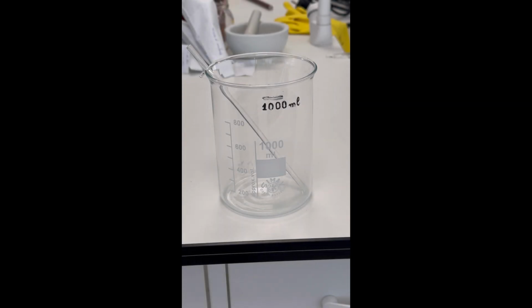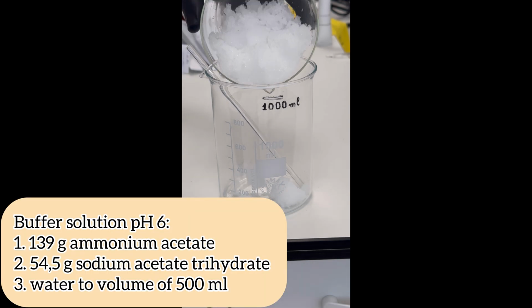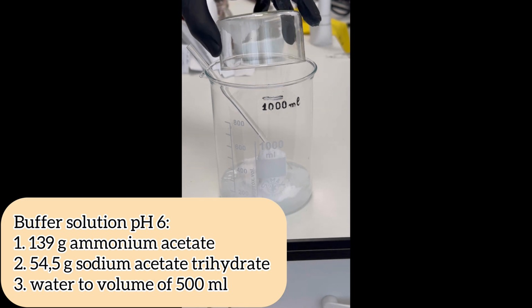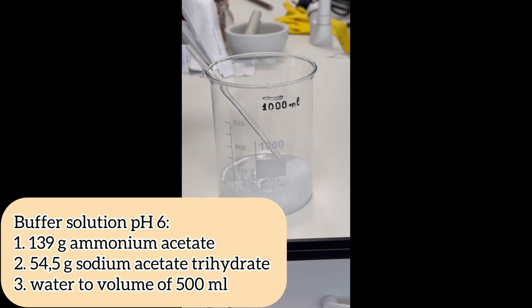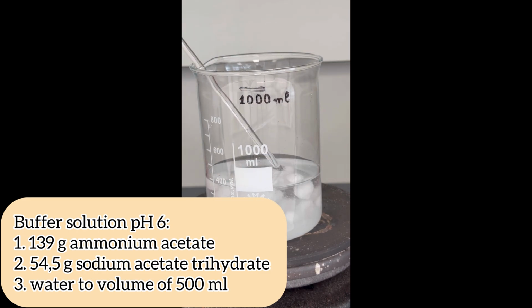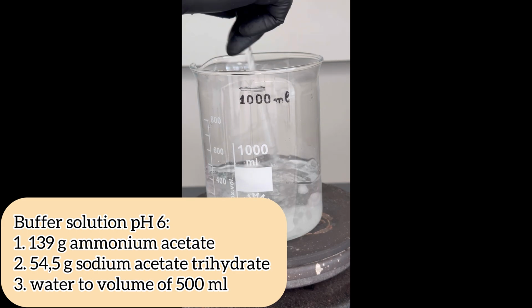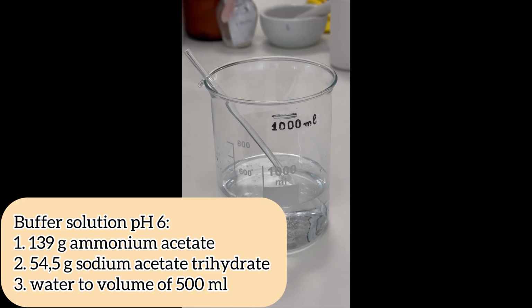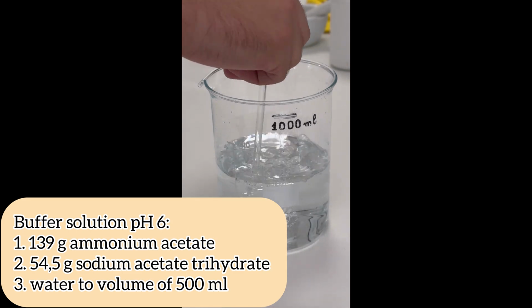Finally, we need to prepare a buffer solution with a pH of 6. We transfer 139 grams of ammonium acetate and 54.5 grams of sodium acetate trihydrate into a 1-liter beaker. It is filled with distilled water to around the 400 milliliter mark and placed on a hot plate. With heating and occasional stirring, everything should dissolve. The beaker is removed from the heat and diluted with distilled water to 500 milliliters.